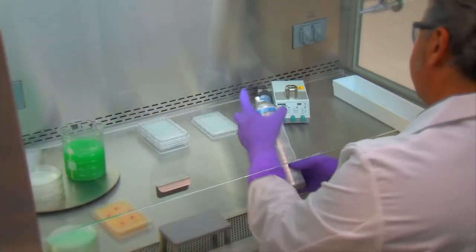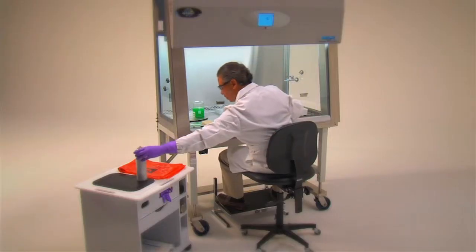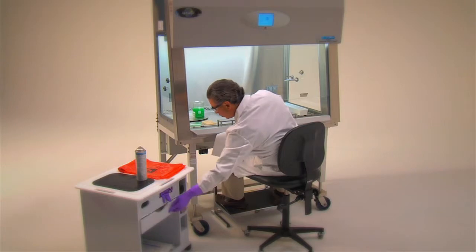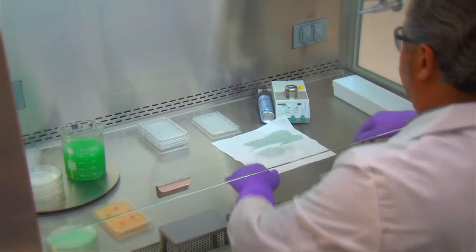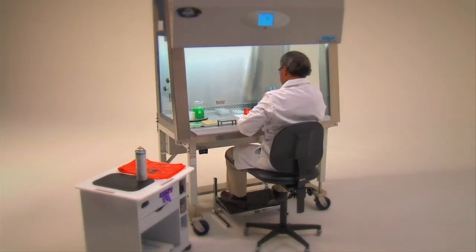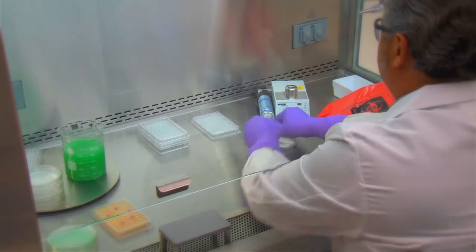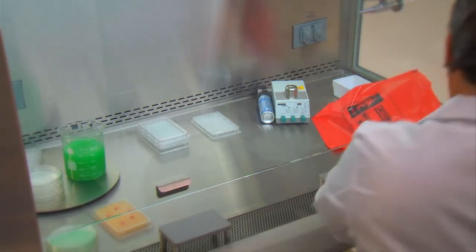Small spills within the cabinet can be handled immediately by removing the contaminated absorbent paper toweling and placing it into the biohazard bag. Any splatter onto items within the cabinet, as well as the cabinet interior, should be immediately wiped with a towel dampened with an appropriate disinfectant. Hands should be washed whenever gloves are changed or removed. Perform decontamination steps while the cabinet is operating to prevent the escape of airborne contaminants. Spray or wipe all potentially contaminated walls, work surfaces, and implements with an appropriate disinfectant.